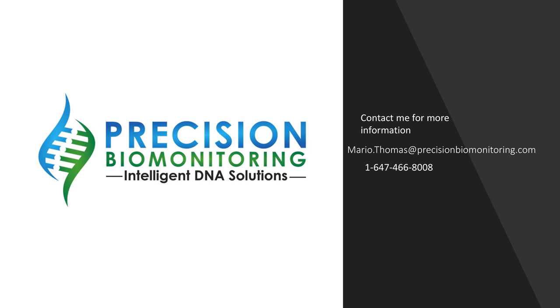Thank you very much, Rémi, for your insights on this. I have another question here from Soren. Soren is asking how the number of DNA reads captured from different species could be translated to the actual number of those species in the environment, how the normalization is done.